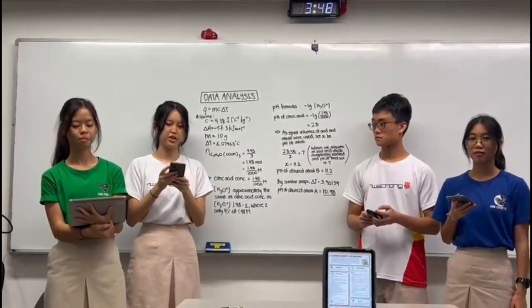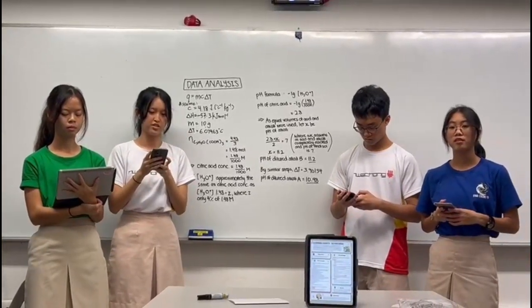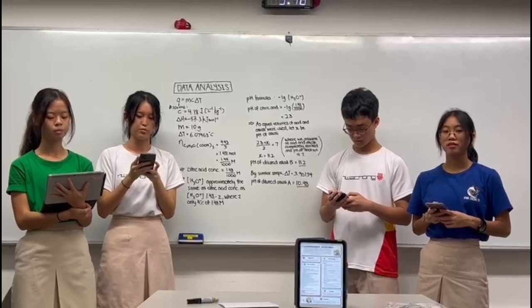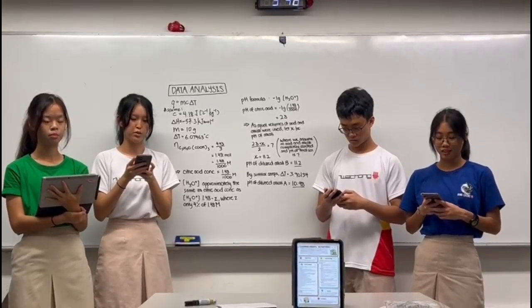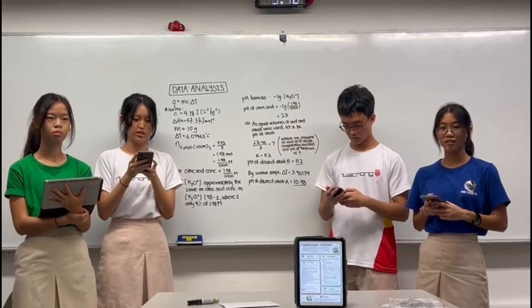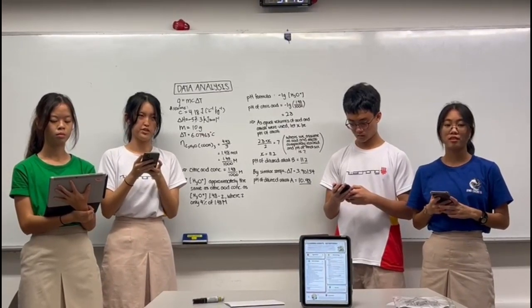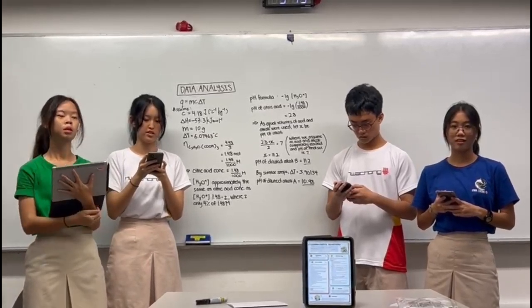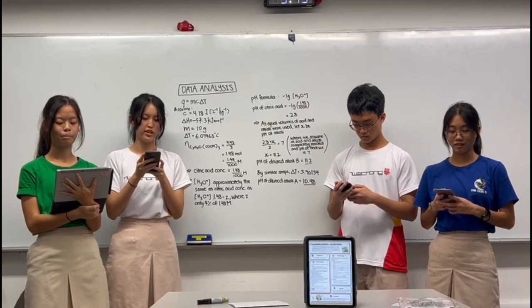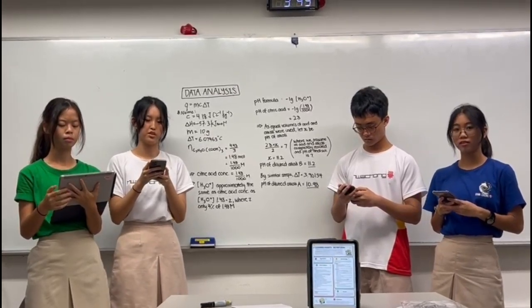Today we will be sharing with you our experiment involving alkaline cleaning agents. Household cleaning agents like detergents are extremely useful to us as they help break down mineral deposits, algae and food stains. However, given their strong pH properties, they are capable of destroying the layers of our skin when they come into contact with it. Families with toddlers and infants are particularly at risk as young children have much more sensitive skin. Thus, we plan to find out what kind of cleaning agents families should keep away from themselves so as to prevent any burns or chemical injuries.